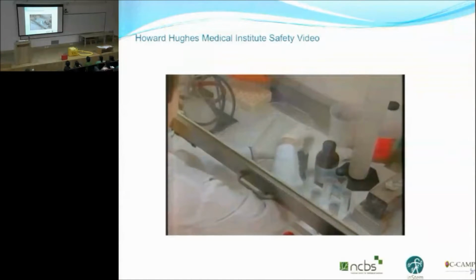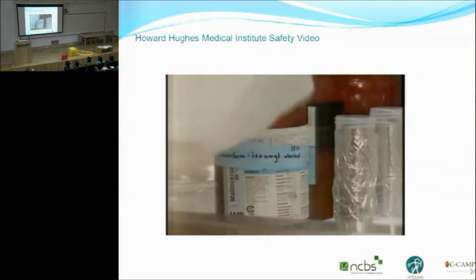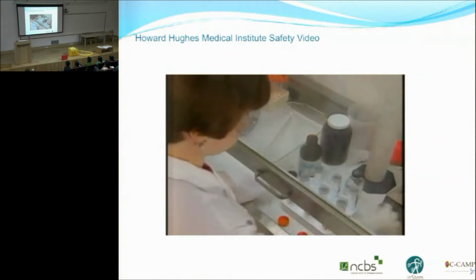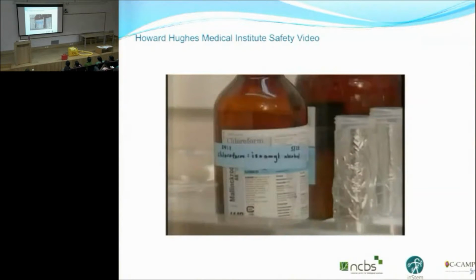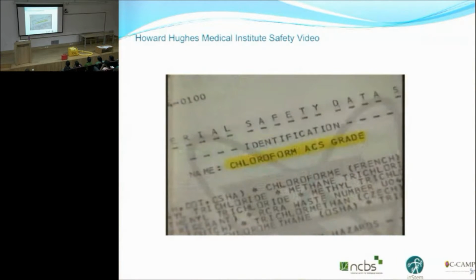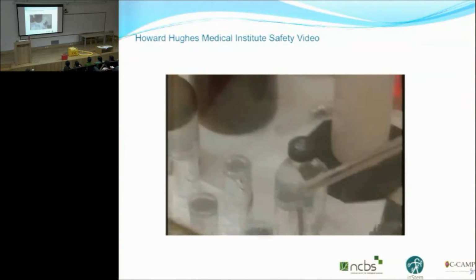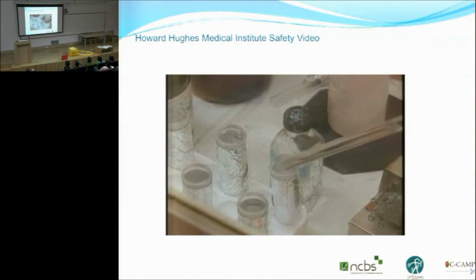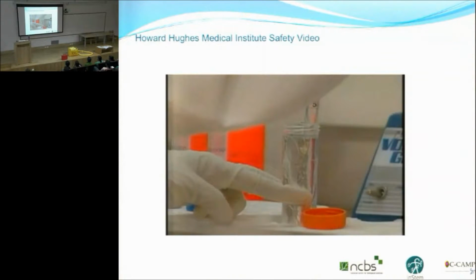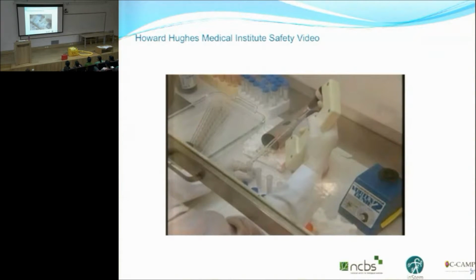When you work with a chemical, consider whether you are doing anything such as heating or combining with other substances that will increase its hazardous nature. Adding chloroform, for example, enhances the ability of phenol to penetrate the skin. Chloroform represents numerous health risks, including cancer and organ damage. It may be harmful by inhalation or skin absorption, and its effects are cumulative. Phenol chloroform extraction in large quantities is best handled in the fume hood because of the inhalation hazard.